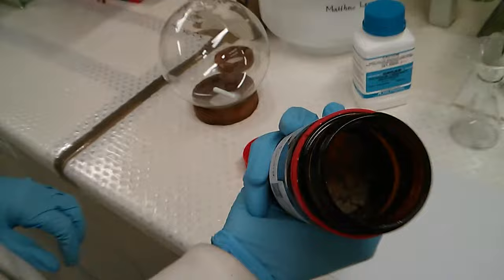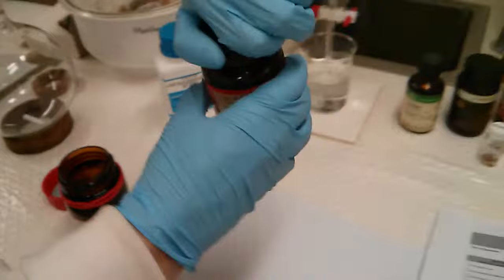And it looks not quite white, but a lot cleaner than the other old gunk. And as an example, here's some really old stuff, which is black, pretty much.